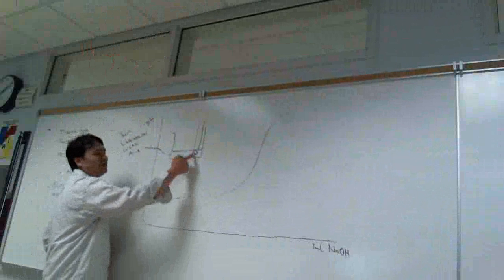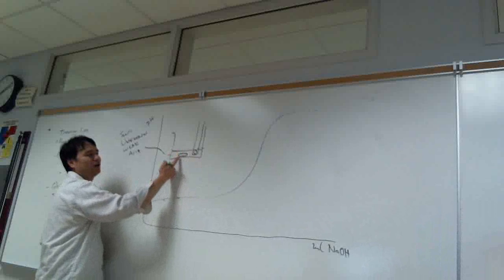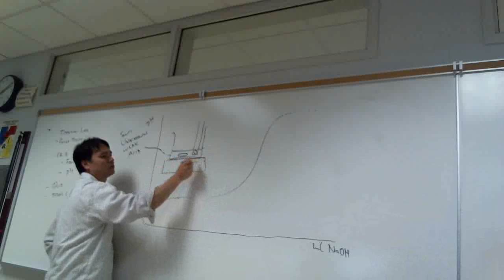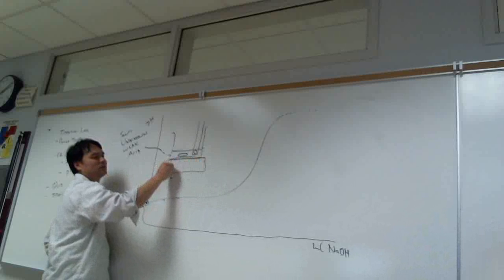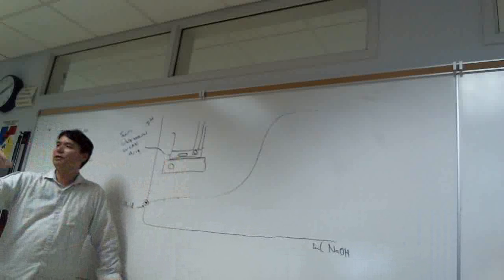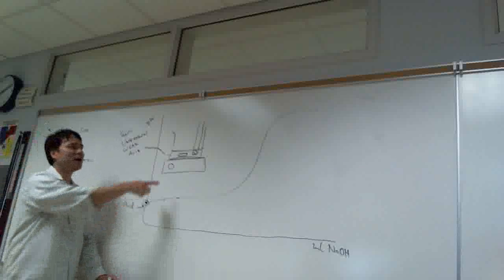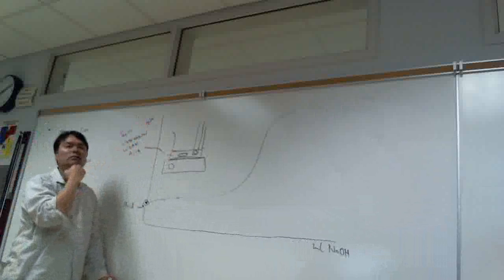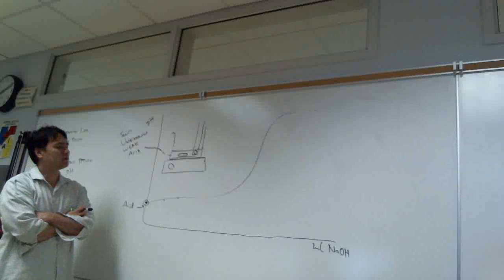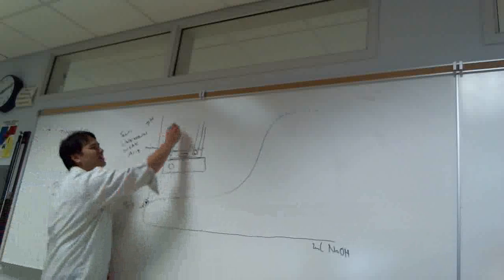All right, not only are we going to have a pH probe in the beaker, but we're going to have a stir bar, which is a Teflon-coated magnet. And the Teflon-coated magnet goes in there because we're going to have this sitting on a magnetic stirrer. With a magnetic stirrer, we just turn this knob and it starts spinning this, so we don't have to swirl. Do you guys remember swirling your Erlenmeyer flasks? Erlenmeyer flasks are easy to swirl because it doesn't splatter out, but if you were to swirl a beaker, then you have more difficulty. And so we're just going to stir this electrically. All right, then we'll start adding.